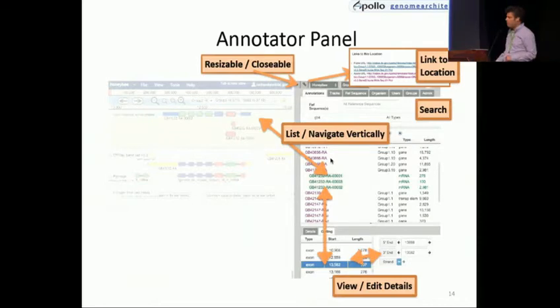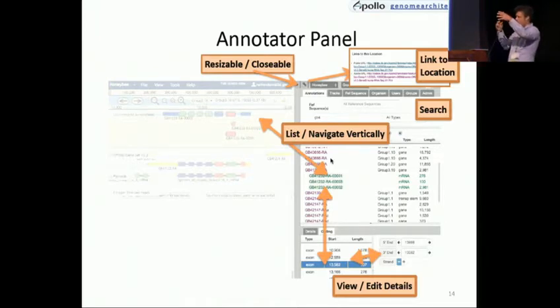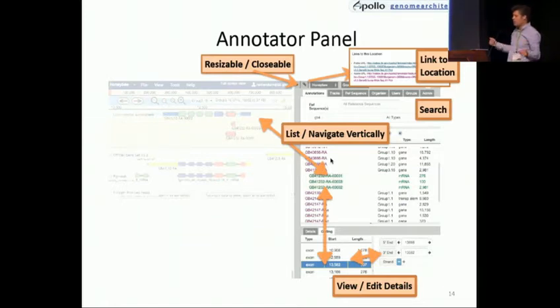This is the third part — the annotator panel on the side. The reason for putting this in is when you're viewing genomic data from left to right, you're focused in on that current view. If you want to see other annotations you've made, or if something's in an isoform, you have the ability to do that quickly, as well as drill into detail without having to zoom in and zoom out all the time. You can search for annotations across all of your scaffolds quickly, and you can link to share a location with other users. It's also closable, so if you want to concentrate just on the annotations you're working with, you can do that pretty easily.